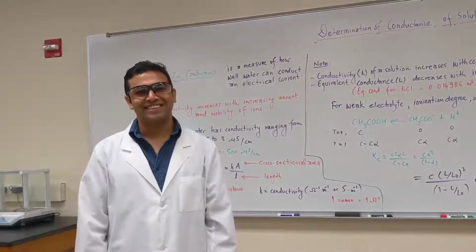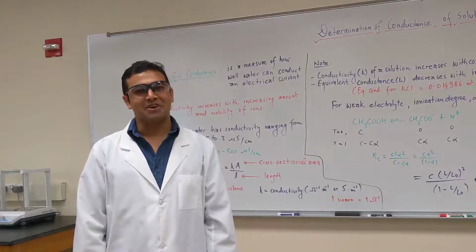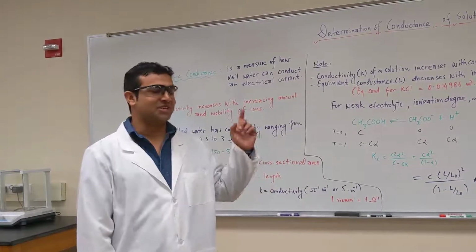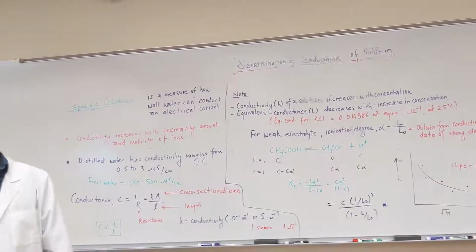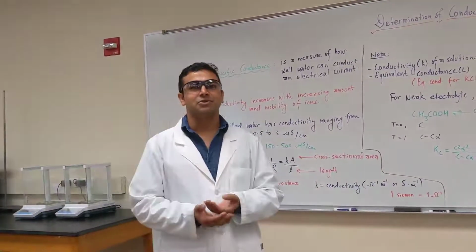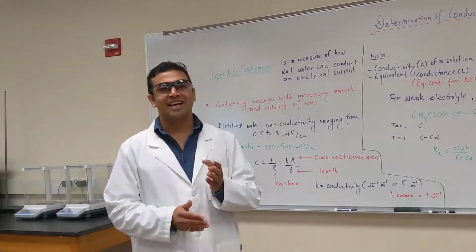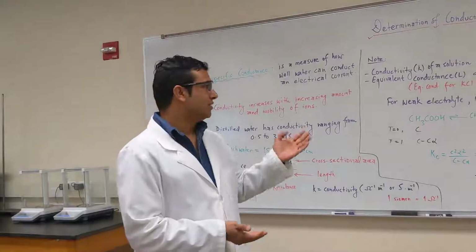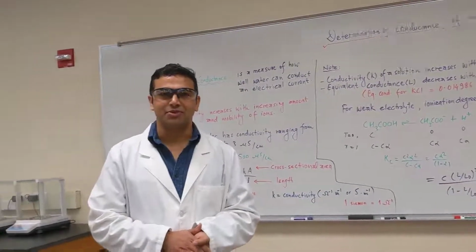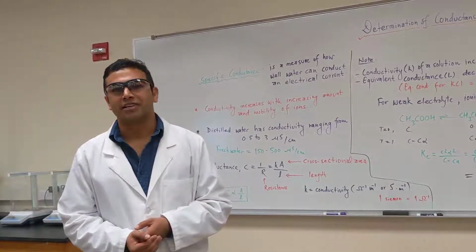Hi students, welcome again. Today I am going to talk about another experiment, which is named the determination of conductance of a solution. Today I will show you how to determine the conductance of the solution, and after that how to determine the ionization degree of that solution, and lastly to determine the equilibrium constant of that solution.